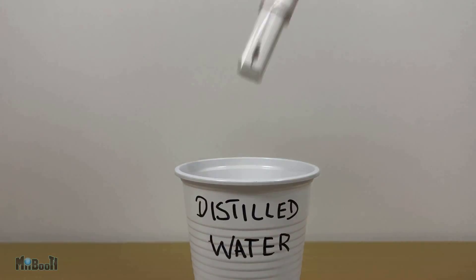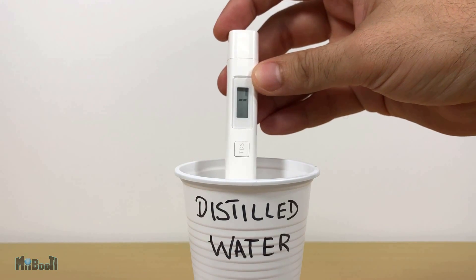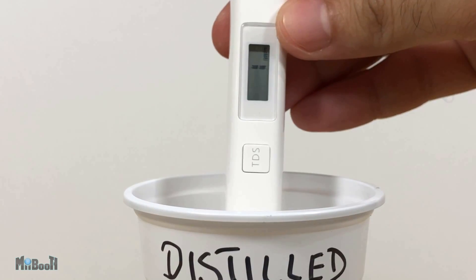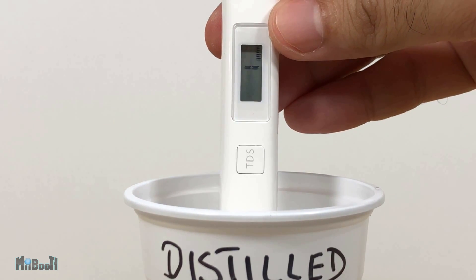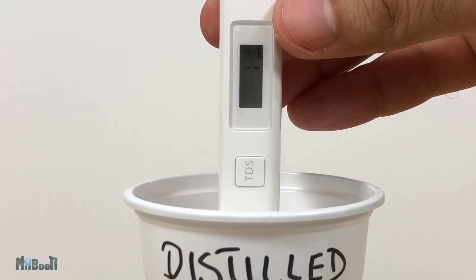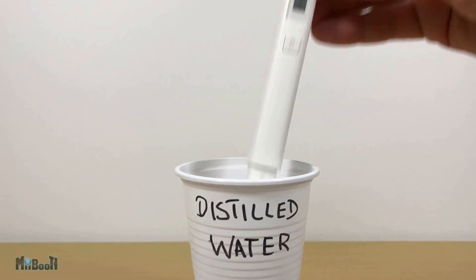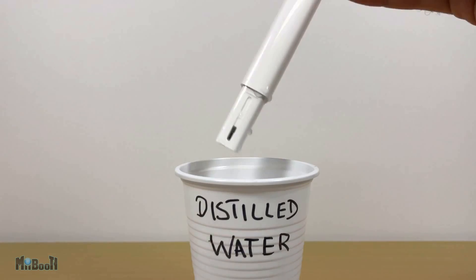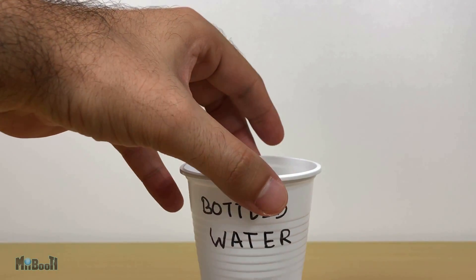I'm going to remove the cap, press the TDS button once to switch it on, and then dip it straight into the cup. It shows 1 — well, technically it should be zero, but I can understand that can be quite difficult to achieve with the packing and all. This is as distilled as it can get, but at least I know the machine is working fine.